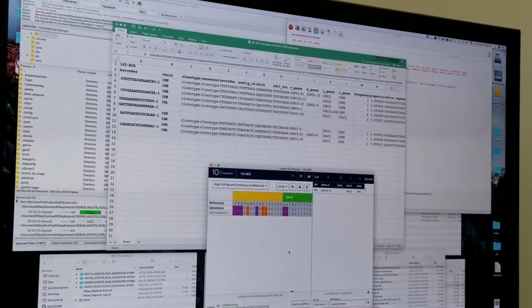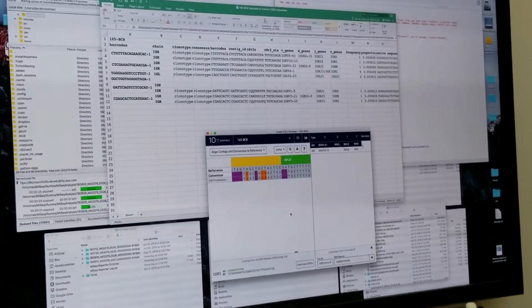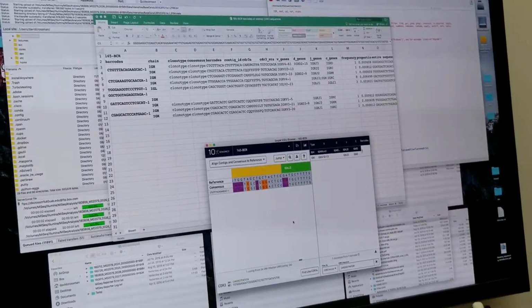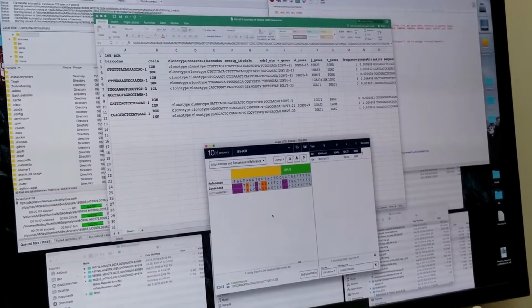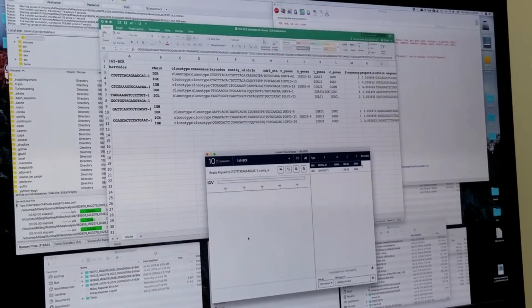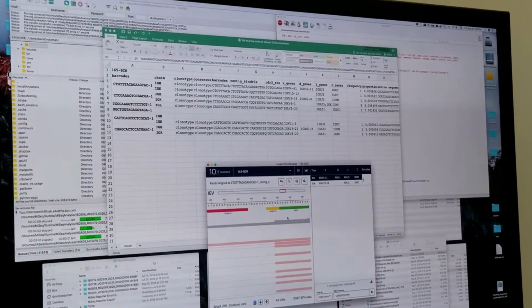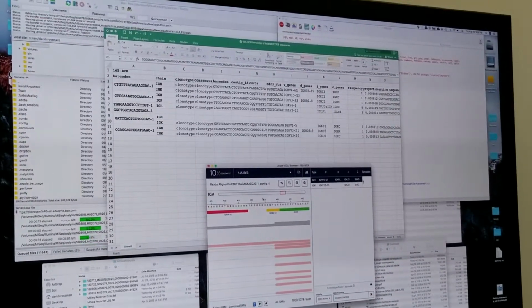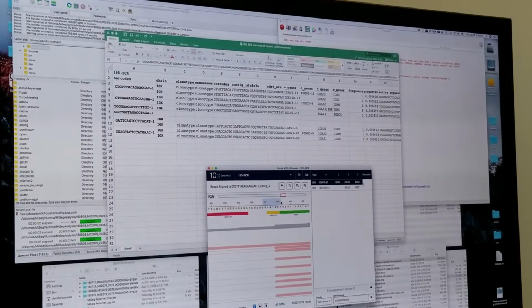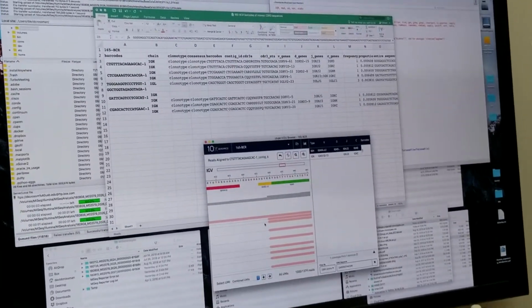So David, when they found it, since those are all those thousands a day, the deletion we think that's real. It's maybe not a sequencing error. Let's look at the read. Yeah, that's the support, especially that big deletion. I go right here. So if I'm only interested in this sort of region, that's where the CDR3 is... well, no, that's not it, is it?